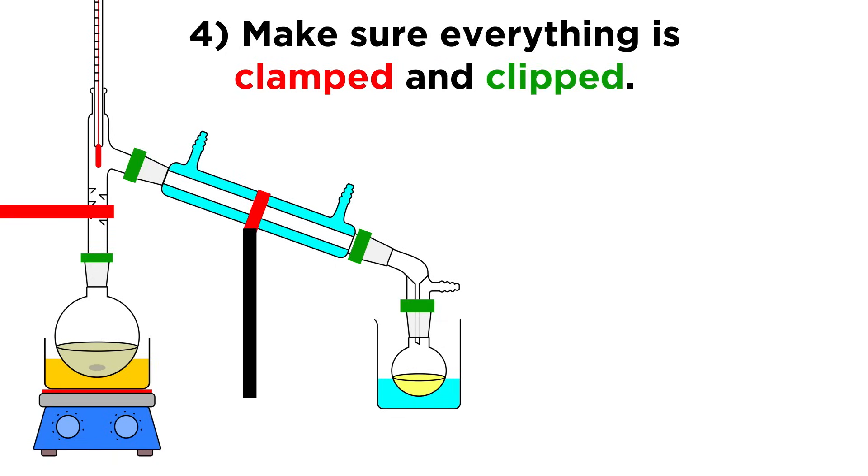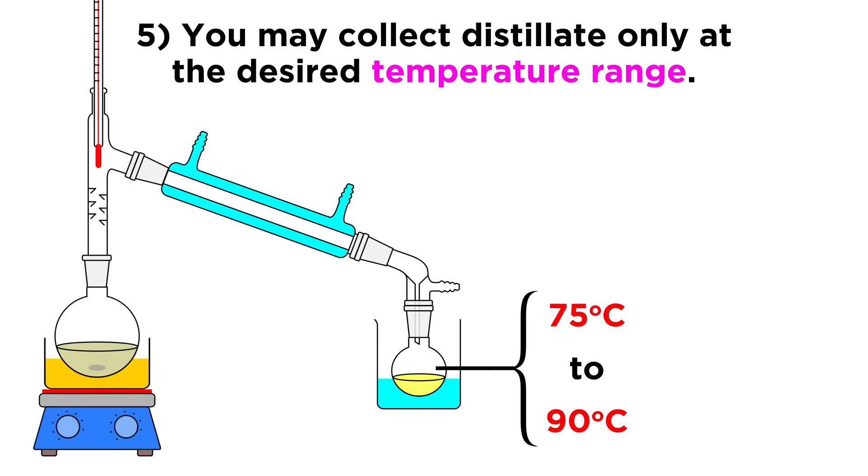Fourth, make sure every piece of glassware is clamped properly, especially the condenser. Clips should connect everything. And lastly, it's sometimes a good idea to just collect distillate at the desired temperature range that corresponds with the boiling point of what you want. This will minimize contamination.